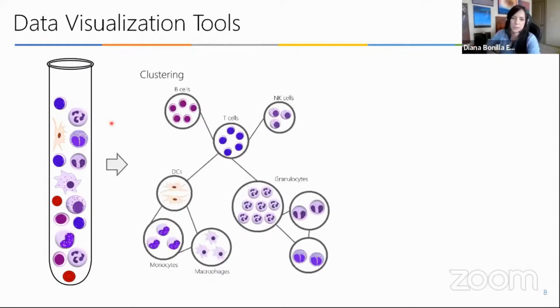So what do you need to do then? There are many computational tools that simplify that workflow and allow you to do what manual gating does in a simpler and faster way. What you would need to find is a tool that allows you to define the different subsets that are present. There are multiple approaches to do that. Just to give you two examples, but again, there are so many other ways to do it. One of them, as Rui mentioned, is clustering.